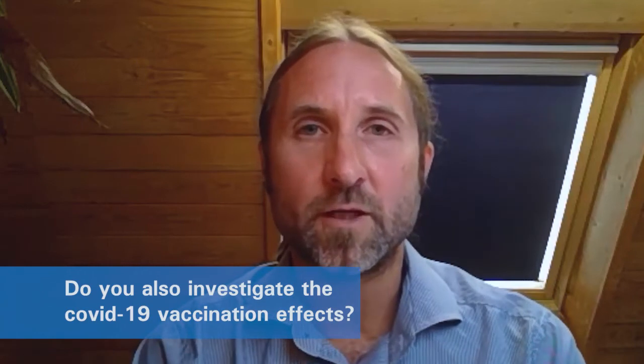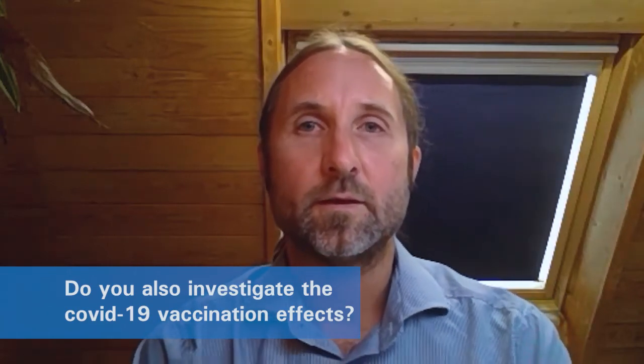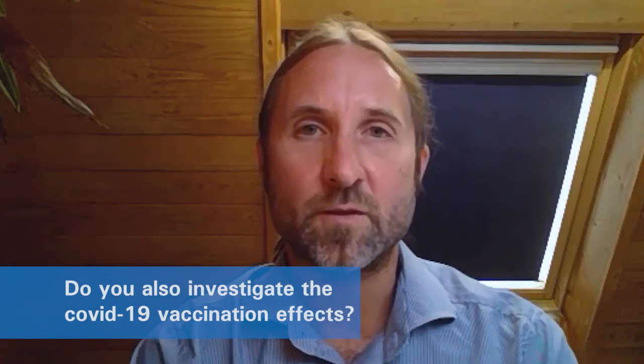And this really offers unique possibilities to screen the patient during the disease and also to check how a potential treatment could help the patient and change the metabolomic signature. I'm personally not, however, a collaboration partner, the Medical Genetics, are exactly investigating this. We might receive some samples from them in the future, but that's not clear yet.